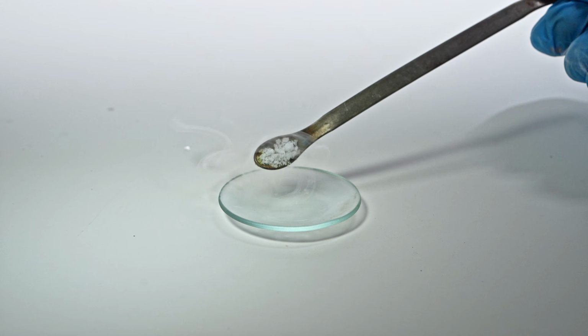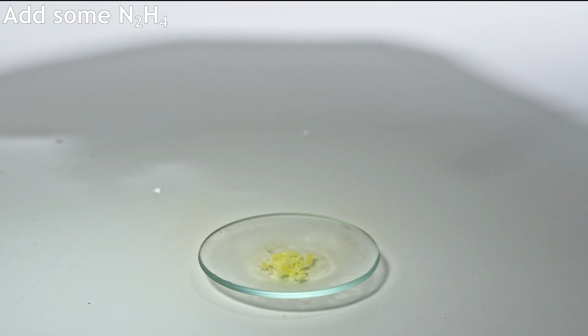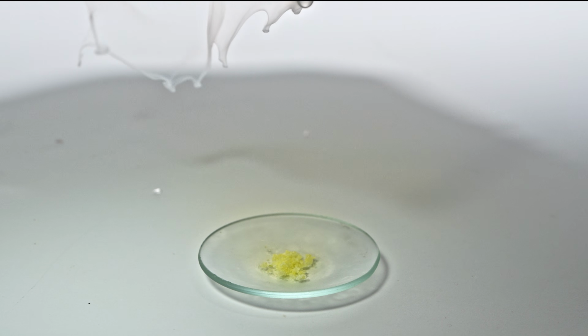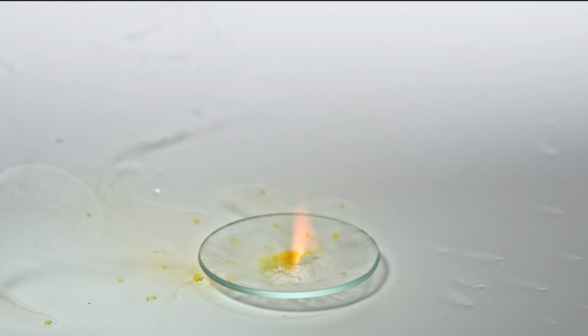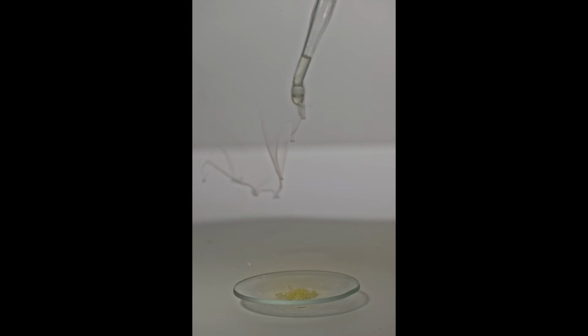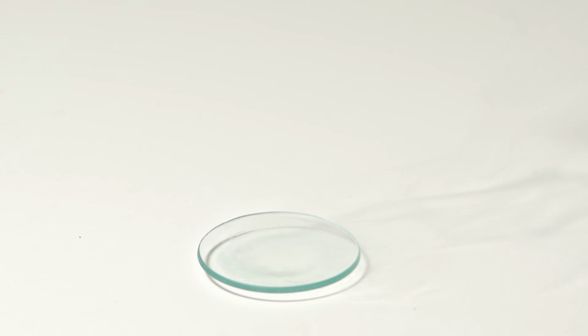Now I'm going to add a few drops of anhydrous hydrazine to the dinitrogen pentoxide. And here is the reaction of anhydrous hydrazine with fuming nitric acid for comparison.